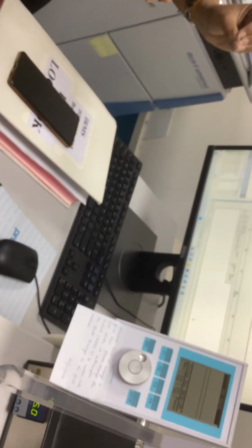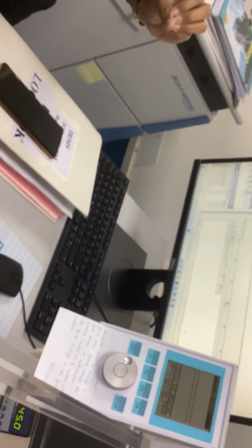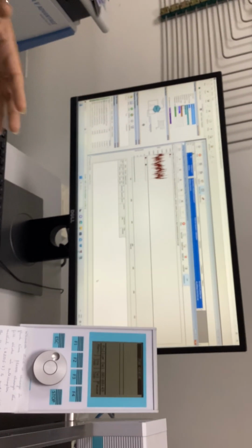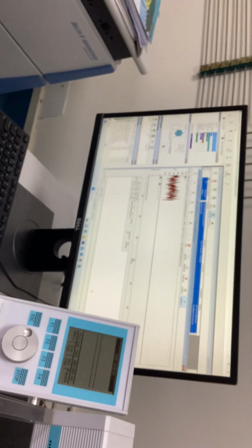So for flushing, if this is the flushing needle and it's going here, do you change the command from there? We don't do anything. We don't give any command. We have our method set. So when it has to get flushed, they get flushed continuously depending upon the equilibration time, and they get analyzed the same way. For this protocol particularly, we use 2 rows flush, 2 rows analysis.